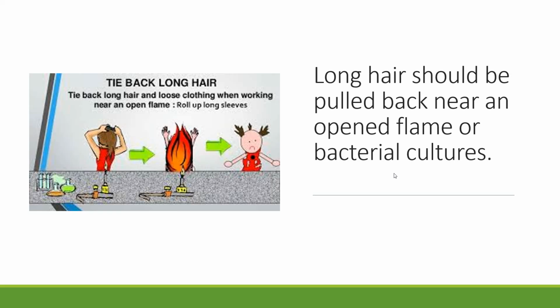You'll also notice that a lot of times in clinical settings or dental offices, things like that, people will wear caps or have their hair pulled back as well, just to prevent that from being loose and cross-contaminating.